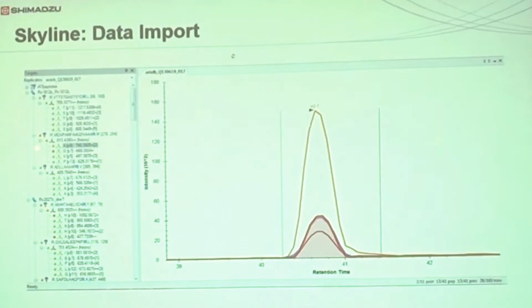So depending upon your selection criteria, you will select which peptides have to be kept for further analysis and which have to be removed. Most of the peptides which are giving you a red color symbol, you will remove them in the filtration and you will keep only those peptides which are giving a green color symbol. And then those transitions you can use for further analysis. On that method, you will be analyzing all of your samples, and then you can compare the peak areas for all the samples and perform the relative quantification analysis.